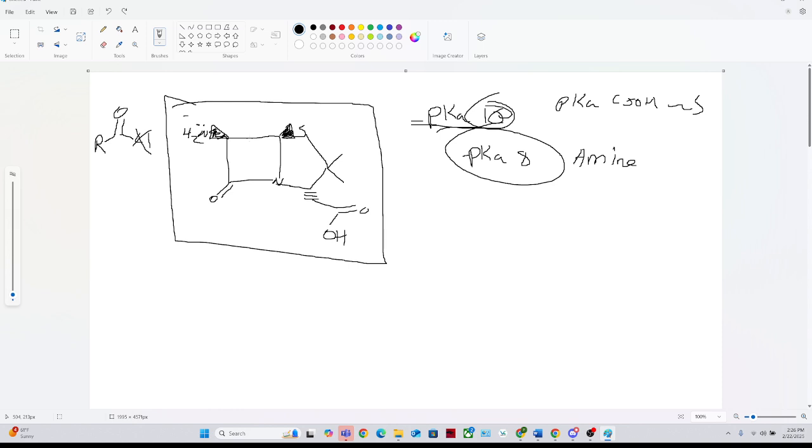Your solvent actually is water, so this is going to be a big concern. If you make a solution too basic or too acidic, what you could also get as a side product is the hydrolyzed beta-lactam. You don't want that to happen, so you have to take pretty good precaution, and I'll explain where this precaution is taken to ensure that you get good product.